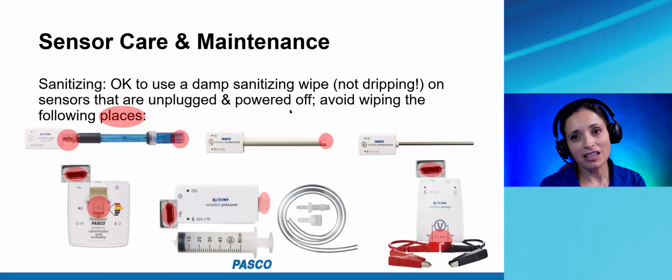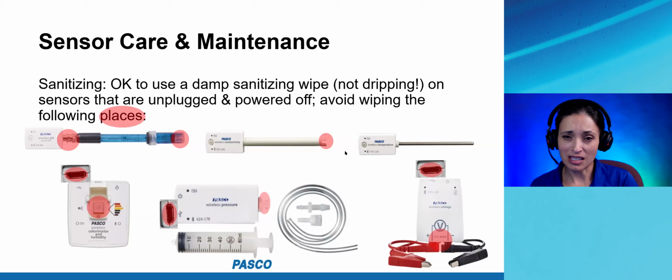Other questions about maintaining your sensors. How do I clean these? See all the places I've highlighted pink here? Don't get those places wet with a sanitizing wipe. Everything outside of those areas can be cleaned with a sanitizing wipe.